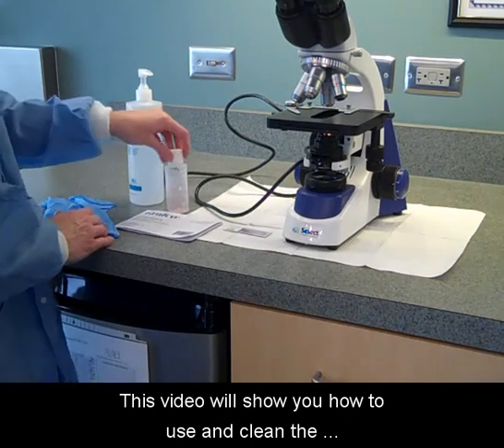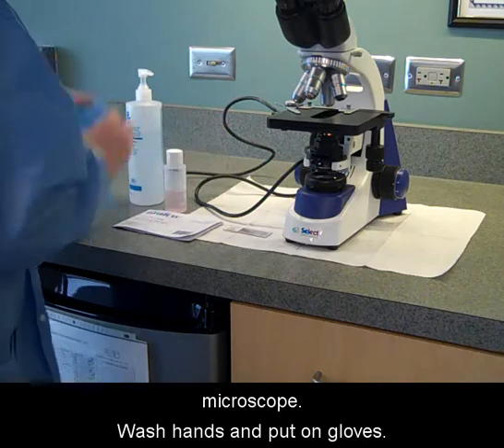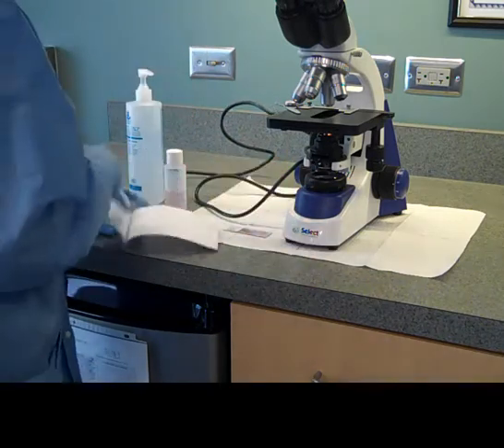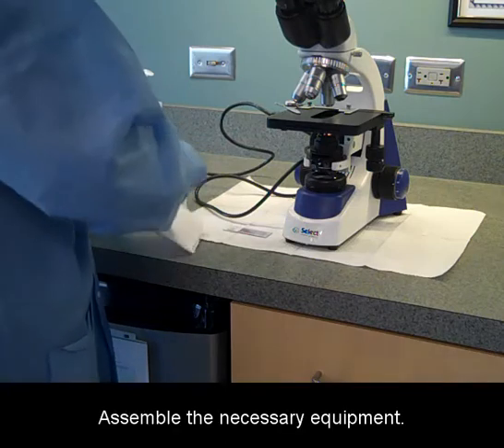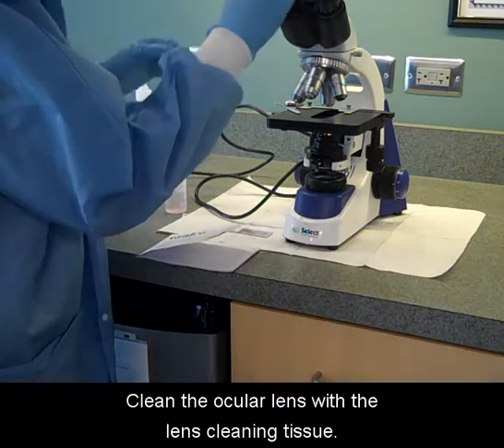This video will show you how to use and clean the microscope. Wash hands and put on gloves. Assemble the necessary equipment. Clean the ocular lens with the lens cleaning tissue.